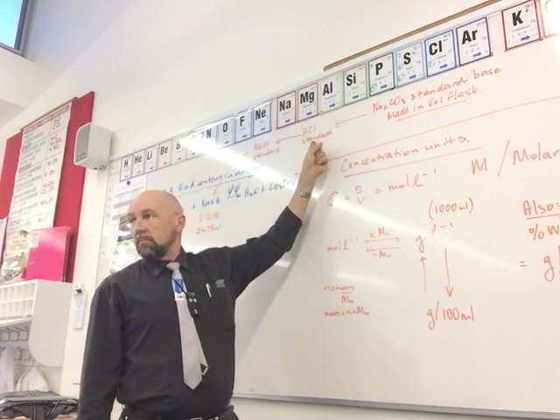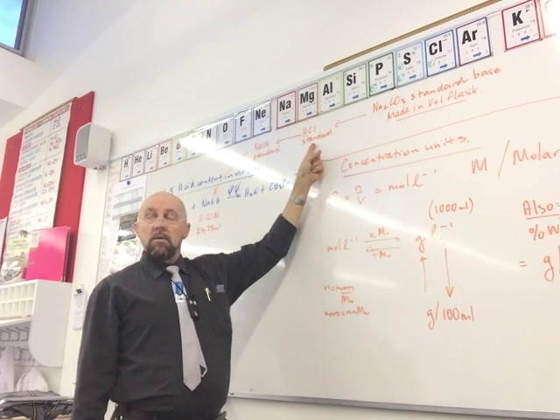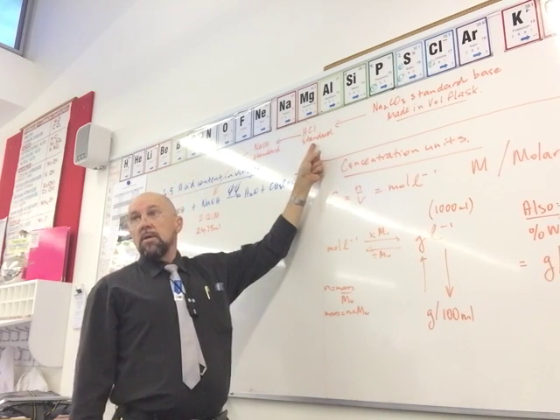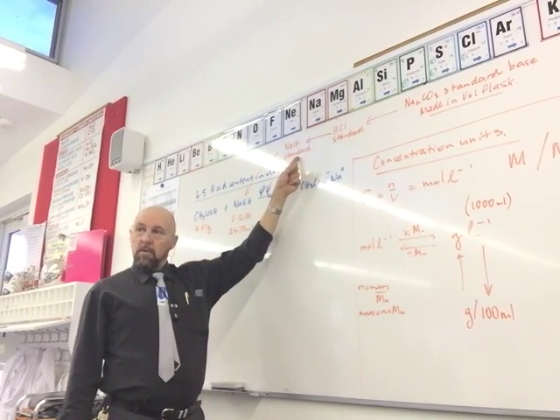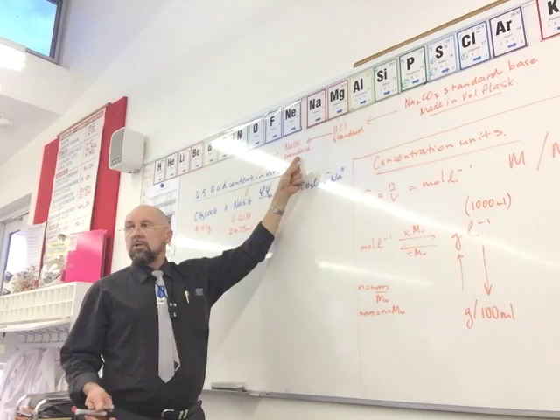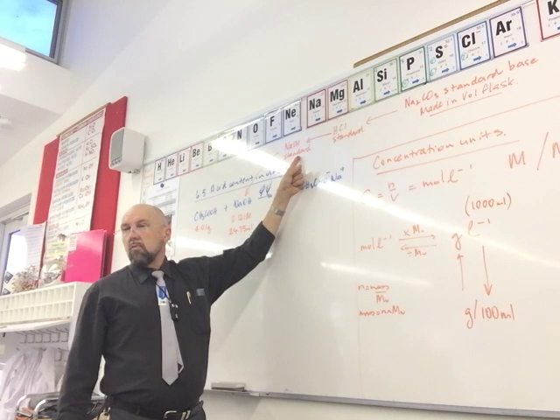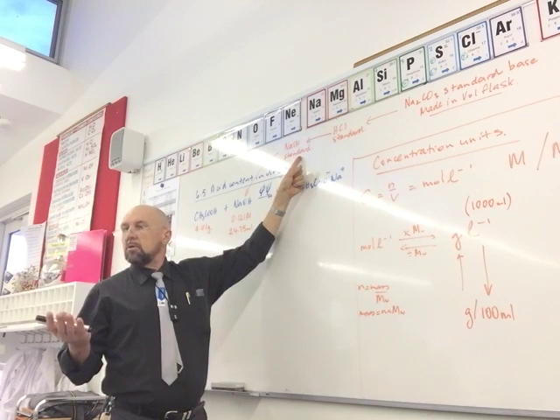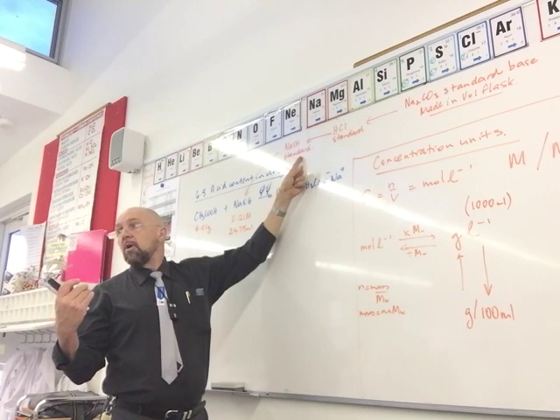We had to make sure, we had to prove to ourselves, using our known, and we come up with a concentration of HCl. We then used HCl to work out the sodium hydroxide, because the sodium hydroxide has got an issue. What was the issue with sodium hydroxide? It wasn't pure, it was in a liquid solution. It wasn't liquid. Sodium hydroxide is a solid, but what does it do? It gets water from the... It does, yeah. So in other words, it absorbs moisture over time.